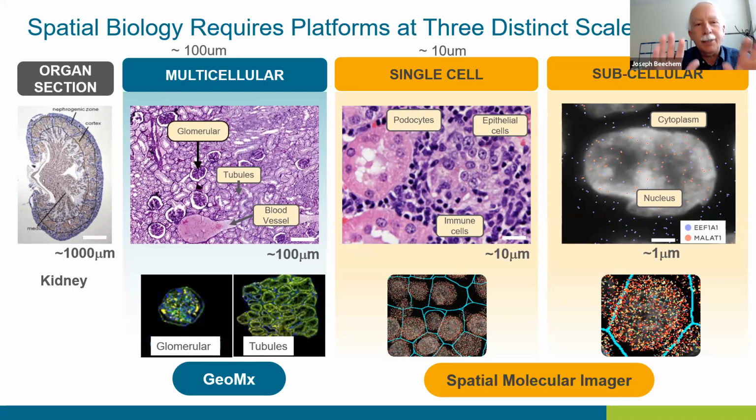The other thing I'll mention is that all the technologies I'm talking about today are multi-omic. We're doing both RNA layers of information and protein layers of information. I think you need a couple of spatial domains, you need high-plex, and I believe both the RNA layer and the protein layers are very important to get them all to work together. If you can do it non-destructively, that's even better. All the technologies I'll be talking about today don't destroy the tissue you're measuring on, so you can still do things afterwards.